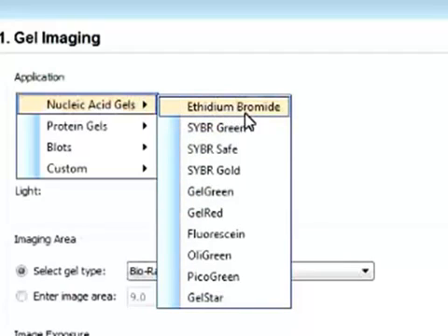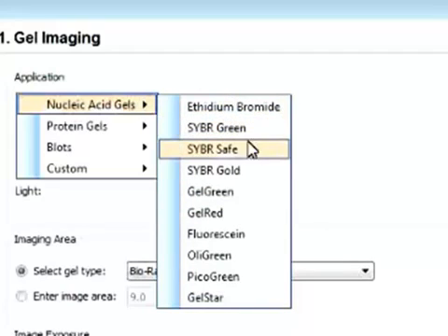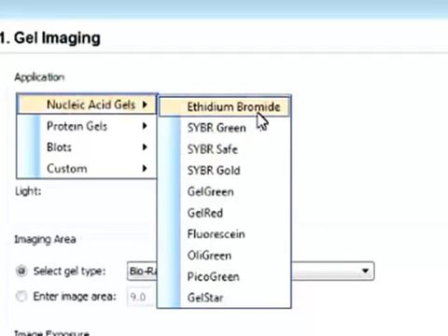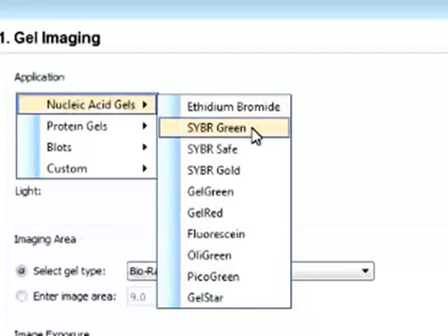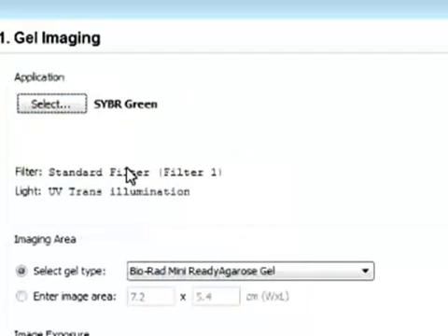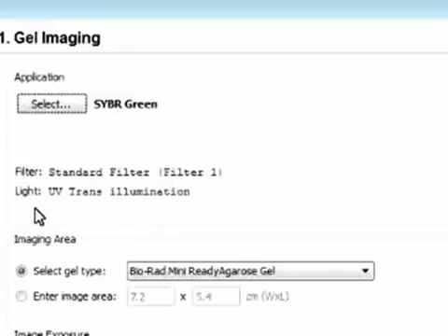We can select the dye we basically stained our gel with. So from ethidium bromide, SYBR Green, or SYBR Safe. Say we want to look at SYBR Green. And now you can see that the filter is selected at filter one, and the light source is selected at UV transillumination. And this is all automatic.